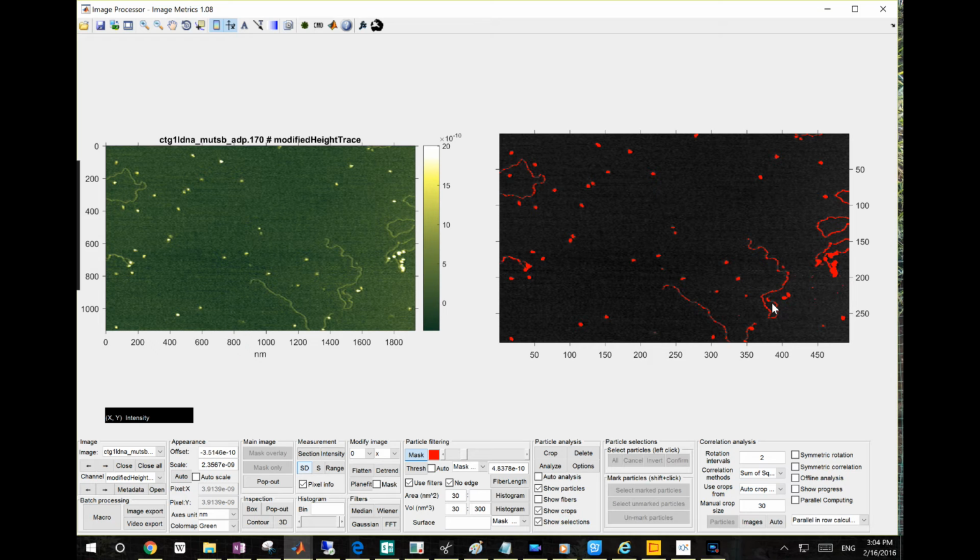So if you want your surface to be zeroed, basically for calibration purposes, especially if you want to calculate the volumes for the protein DNA complex, you have to get the surface to zero level. So you have to use mask flattening. Basically, it excludes the protein and DNA from the flattening procedures.